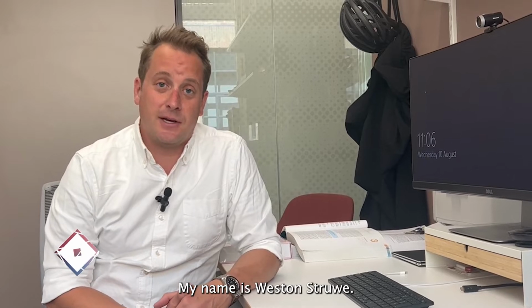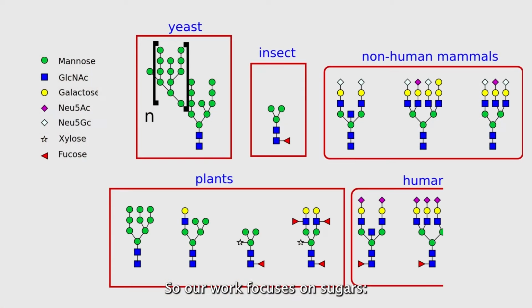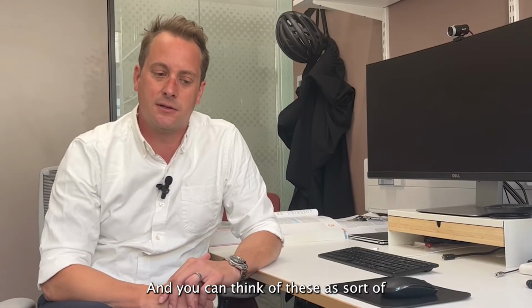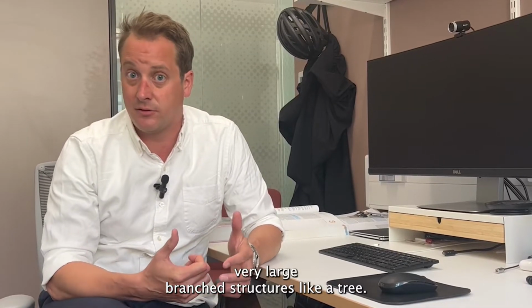My name is Weston Struwe. I'm a PI and a UKRI Future Leaders Fellow in the Department of Chemistry, and I'm based in the Kavli Institute. So our work focuses on sugars, complex oligosaccharides that are commonly referred to as glycans. And you can think of these as very large branch structures, like a tree.